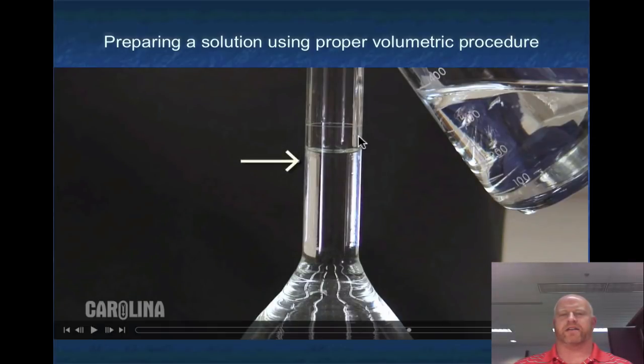Notice how on a volumetric flask, there are no markings on the entire flask except for one line straight across here. A volumetric flask really is only useful for measuring one very specific volume, and it does so very, very precisely and very accurately. So actually, in a usable lab, you will have several different volumetric flasks at your disposal. You'll have a 100 milliliter one, a 200 milliliter, a 300, a 400, a 500, a 1000, whatever you happen to need to get to the correct volume amounts.